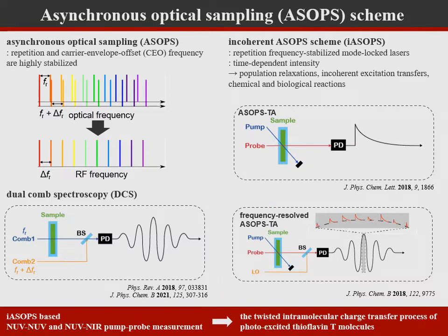In this video, I will introduce the incoherent ASOPS-based NUV-NUV and NUV-NIR pump-probe measurement and the twisted intramolecular charge transfer process of the photoexcited thioflavin T molecules.